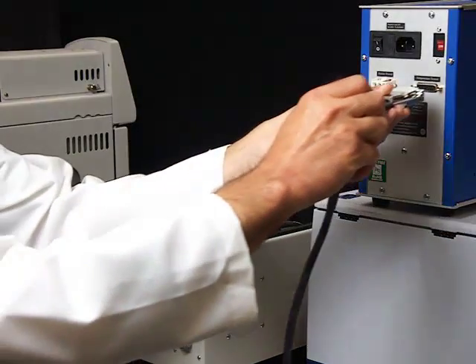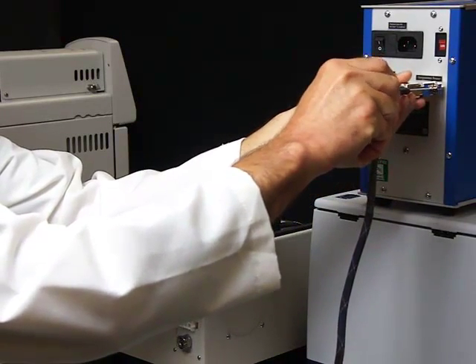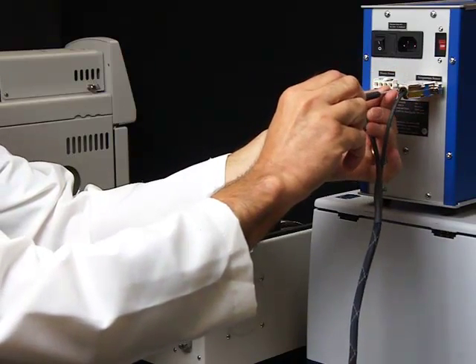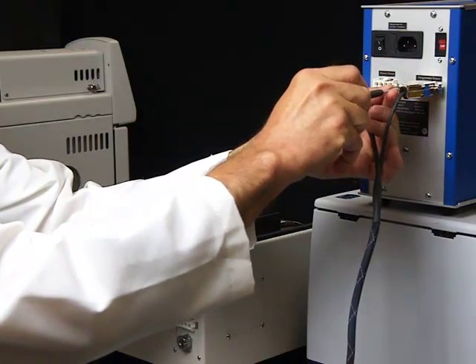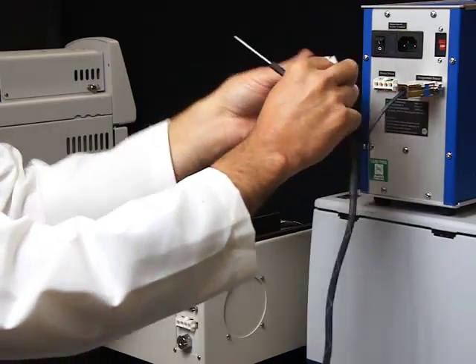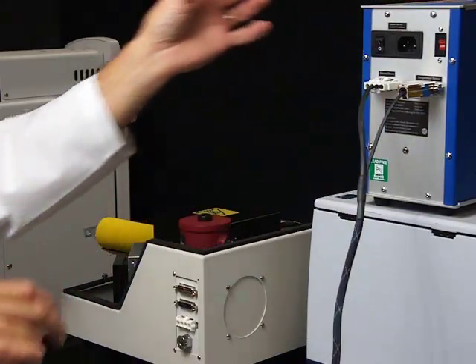Complete the electrical connections. All cables have unique plugs to eliminate mistakes. The following connections need to be completed: connection of temperature sensors, and heater connections for the light pipe and transfer line.